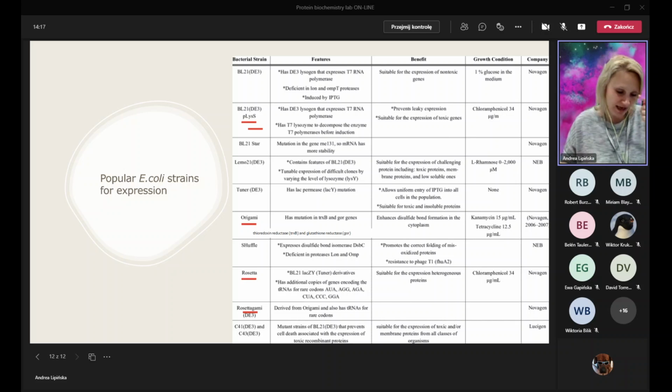Another problem we have with protein folding, generally recombinant protein folding, especially with proteins which have lots of cysteine bonds. GST has lots of cysteine bonds, but still, its folding is not that difficult. But if you have your protein of interest with lots of cysteines and cysteine bonds are required, they may end up in inclusion bodies just because the bacterial oxidoreductases are not that efficient.